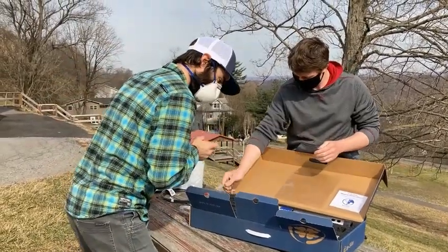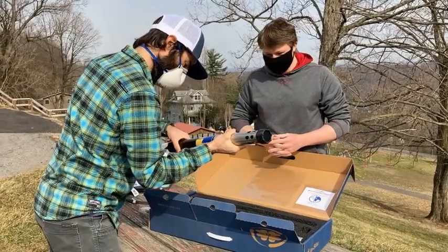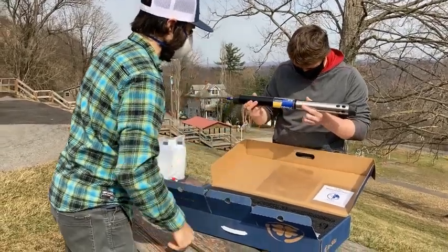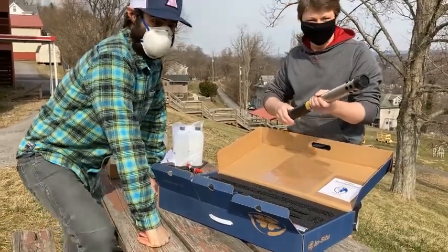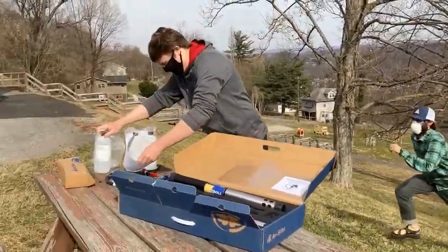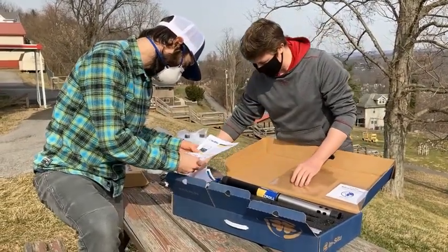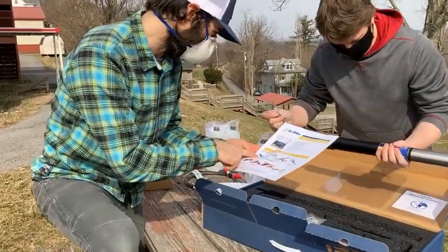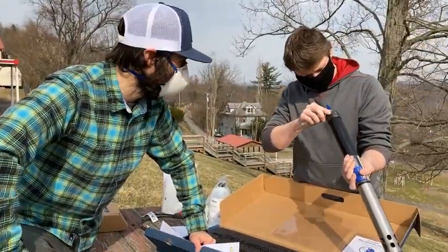Let's fire up some batteries and see if we can turn this bad boy on. How hard can it be to get this thing set up? It doesn't tug, it doesn't really twist, it doesn't really do that. There's got to be something in here — let's see if there are any fasteners. I need that quick start guide — good thing we didn't throw it away. Open battery compartment — they make it seem so straightforward. It says it has a blue part but I don't see a blue part. I'm going to pause right now because this might take a while.